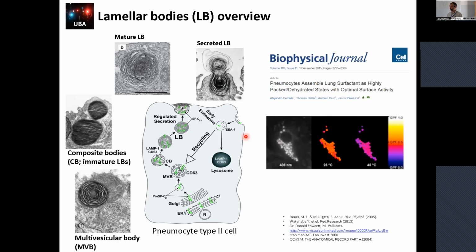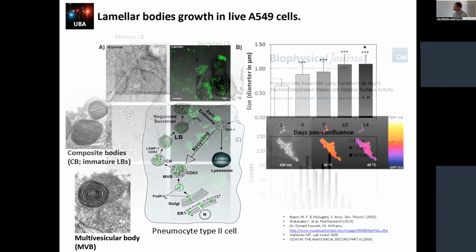And at that point, it was very frustrating for us because we had almost ready the paper to be submitted, and this came out and basically struggled our publication. But lucky for us, we got phasors, and we were doing spectral phasor, and I will show you what phasor tells us, extra information that enabled us to make the publication.